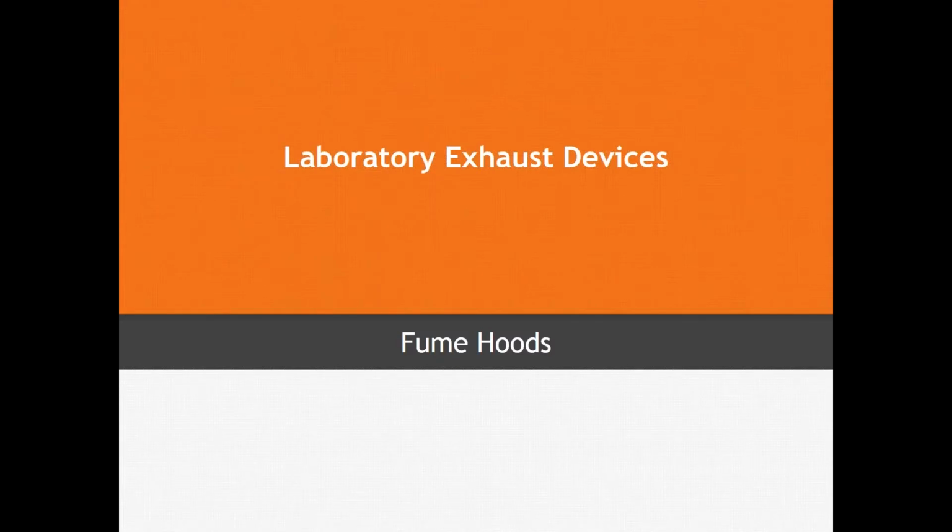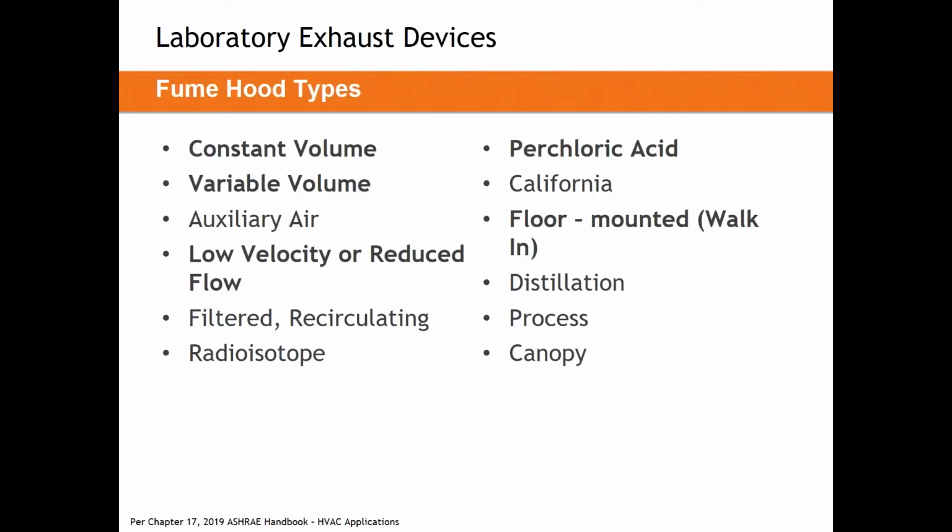Today we'll start with likely the most popular piece of equipment in a laboratory. Fume hoods are really what we talk about most in the laboratory controls business. Every lab is unique. Every lab has different types of equipment, different types of users. They're used to mix and match different types of chemicals. But really one of the unifying themes in a laboratory is that most of them have fume hoods. Most teaching and research spaces will have fume hoods, or at least certain laboratories in a building will have fume hoods for these researchers. So this is really what we want to spend the most time on here today.